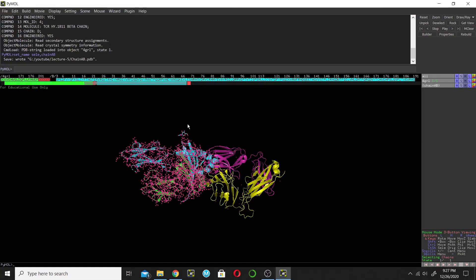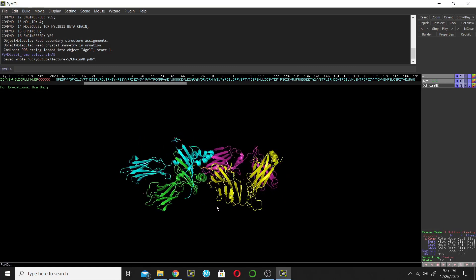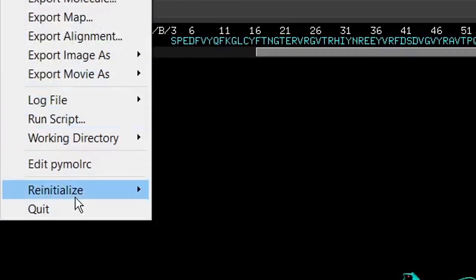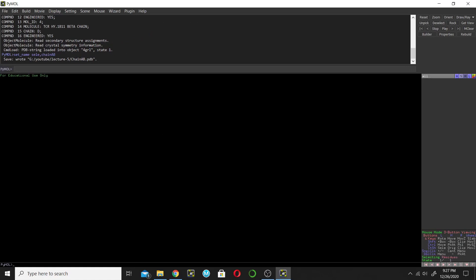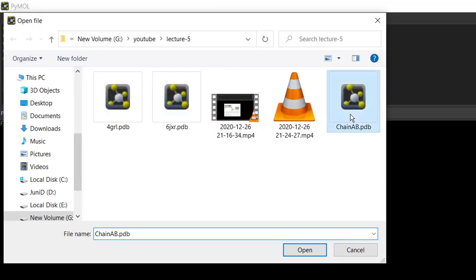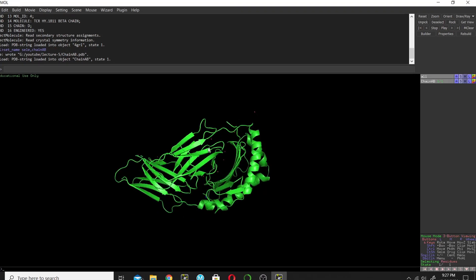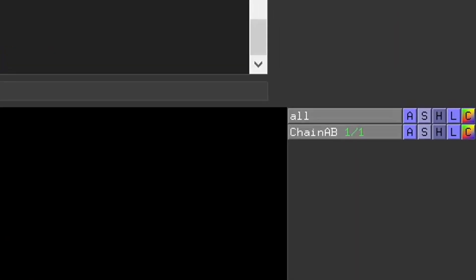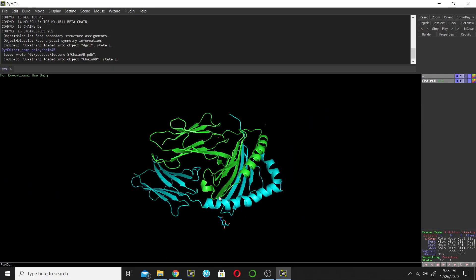Now I want to check whether I really saved these two chains. So I will re-initialize by clicking 'Reinitialize' and then 'Everything' to remove all loaded objects and get a fresh PyMOL window. Now go to File menu, click Open, and open the ChainAB file. Click on Color, then go next to 'All' and click C to color by chain. There are two chains here — confirmed.